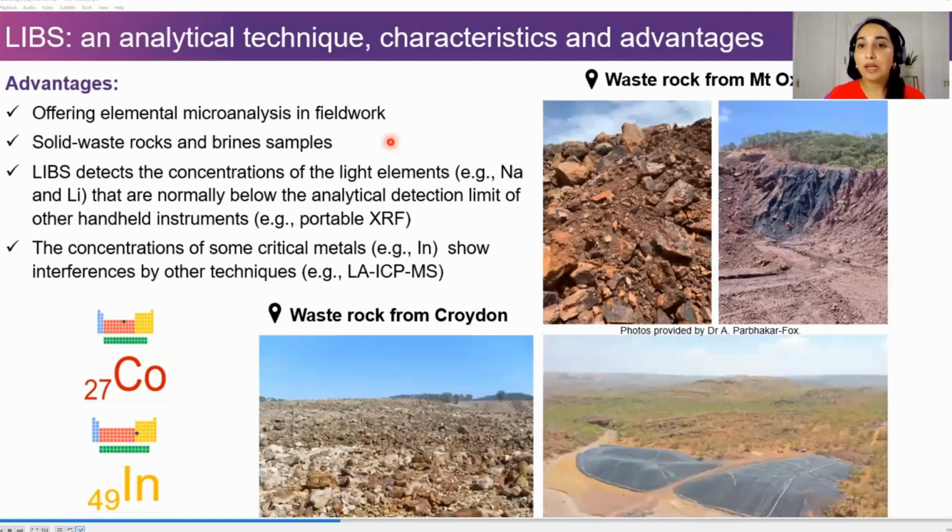But if you want to analyze solid or waste rock or brine samples, yes, you just put this LIBS instrument on your sample. It's also very important that LIBS detects the concentration of light elements, as already mentioned, such as sodium or lithium, that are normally below the analytical detection limit of other handheld instruments, for example portable XRF. Also, the concentration of some critical metals, such as indium, shows interference with other techniques, such as LA-ICP-MS.